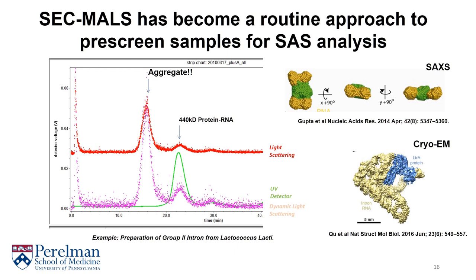We introduced an additional purification step to solve this problem, and this change resulted in success, not only for our SAXS study, but for the subsequent high-resolution cryo-EM structures that were determined afterwards.